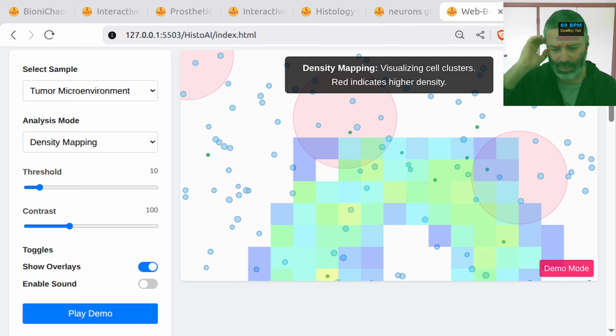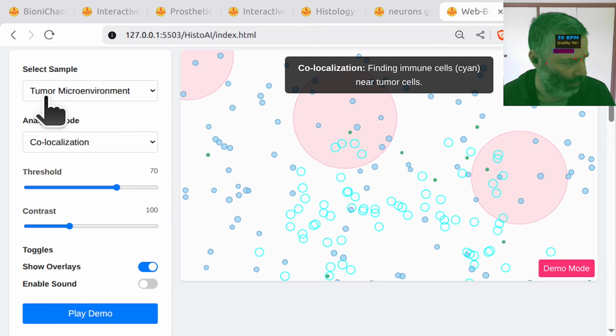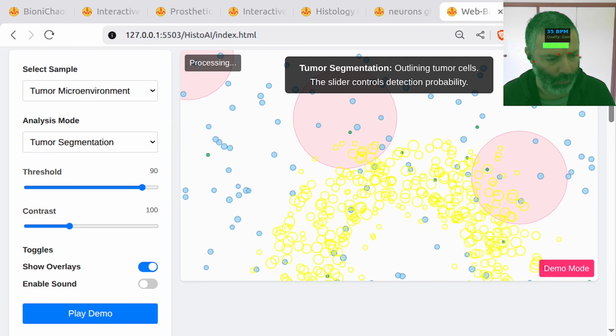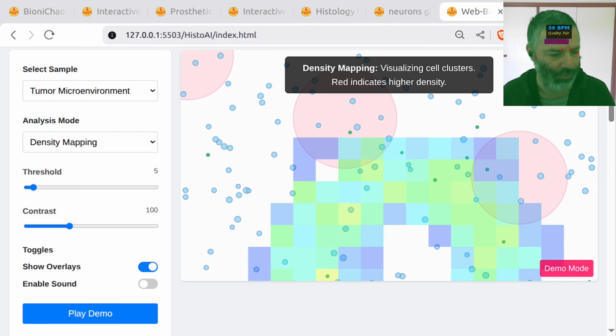It's not sometimes missing, it's always missing. And it's not always meant to be there, it's only meant to be there when we're selecting the tumor version of the sample. Now it's an obvious bug, so if you can be more assertive in your prompt, that would be great.